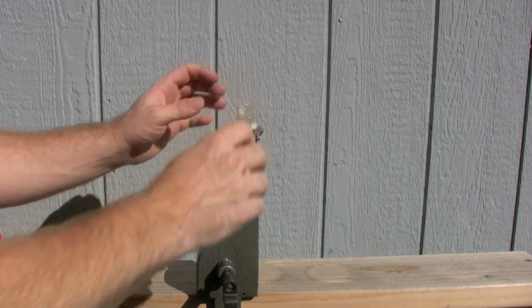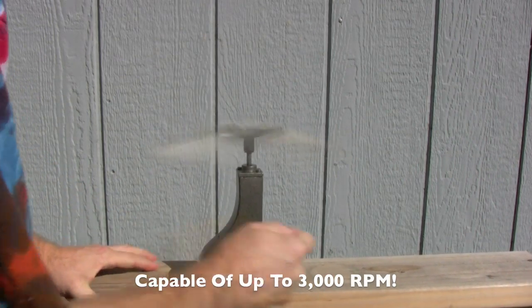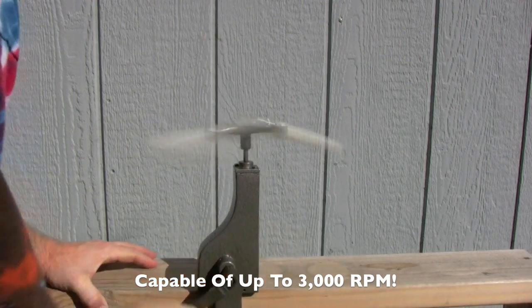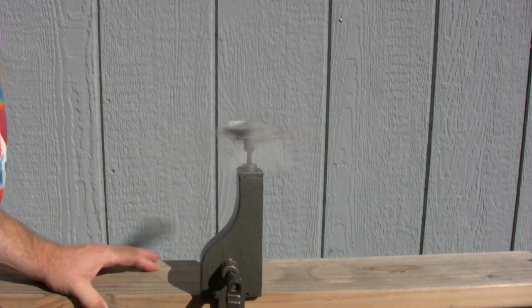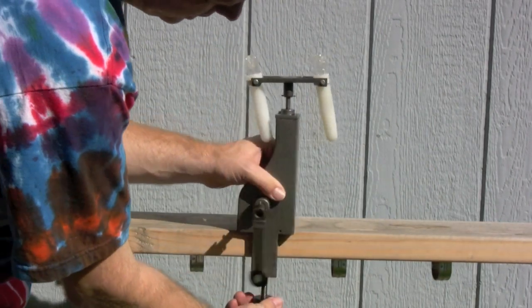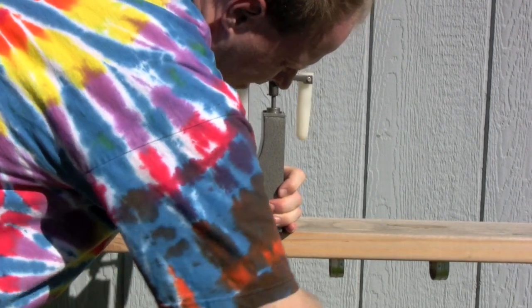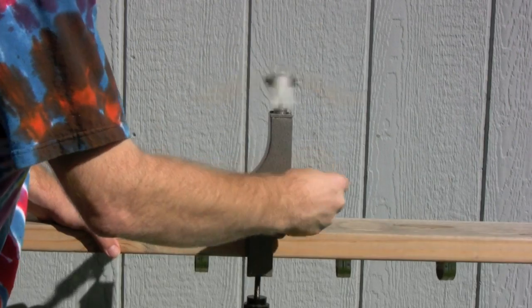When you put your centrifuge tubes in and crank it up, away she goes. The Whirlybird centrifuge can easily attach to any workshop bench with the handy crank. Hook up to the bench, tighten down, and we're ready to go.